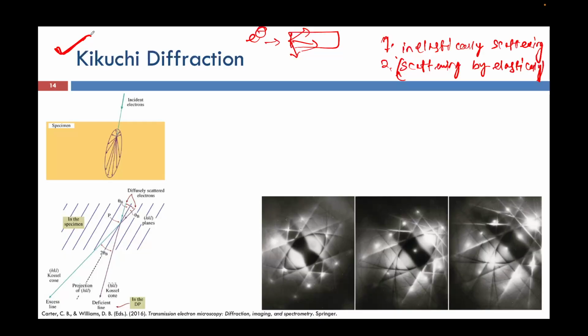Okay, and if we want to see, I am doing it here, let's say intensity versus scattering angle. If I am talking, then the curve will be somewhat coming like this.